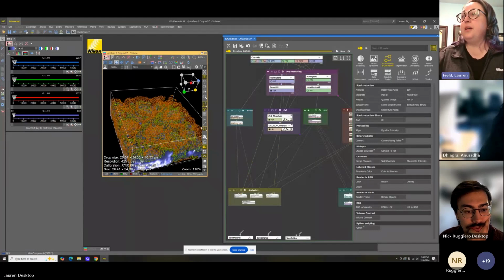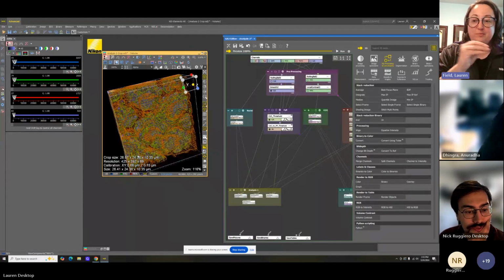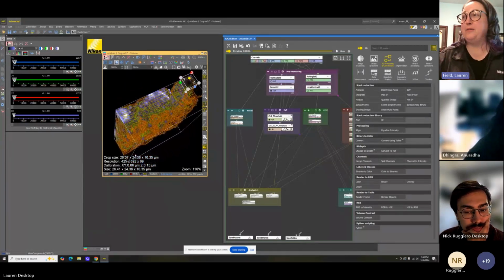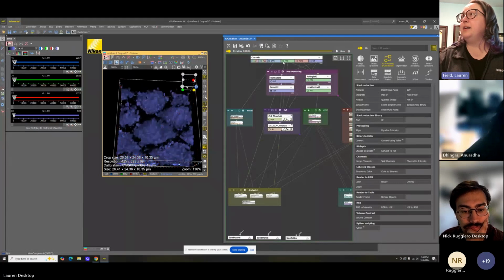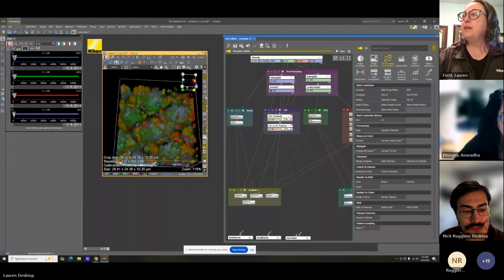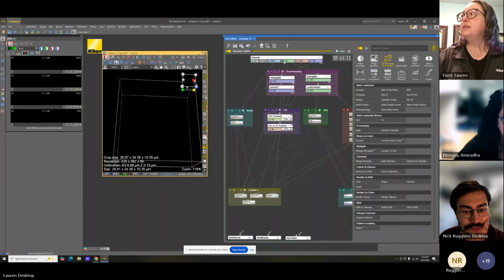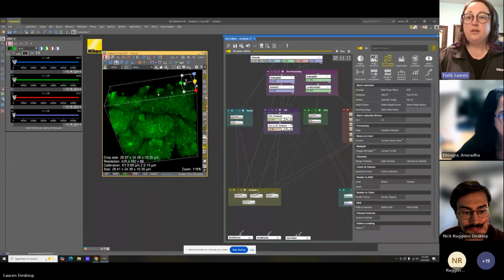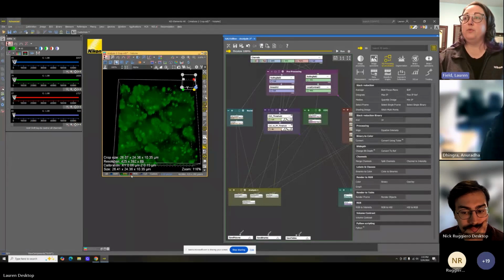The two other channels that we had in this image were very obviously coordinated with each other and labeling a very similar structure, at least from how I was looking at this. So if we stop looking at our Cy5 channel and add back in TRITC and FITC, the FITC channel does have what I would consider some non-specific labeling, if I was going to compare it to only where TRITC was.